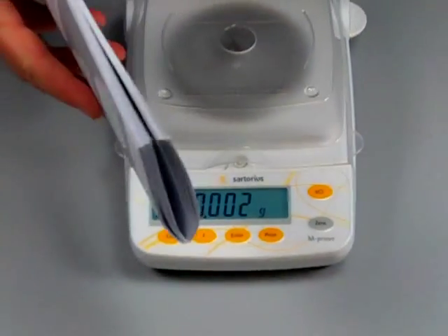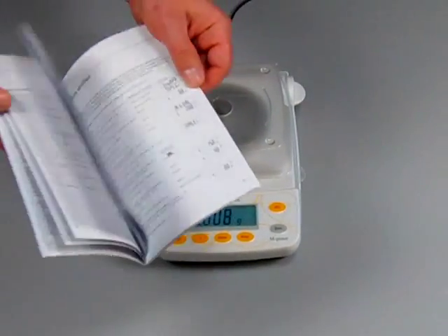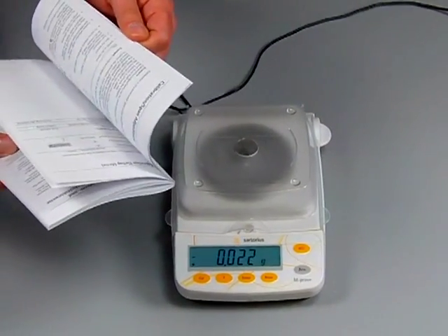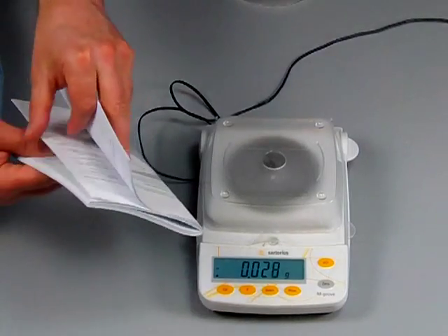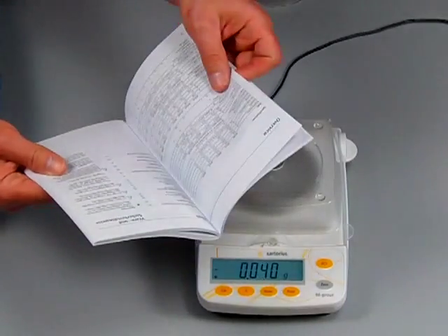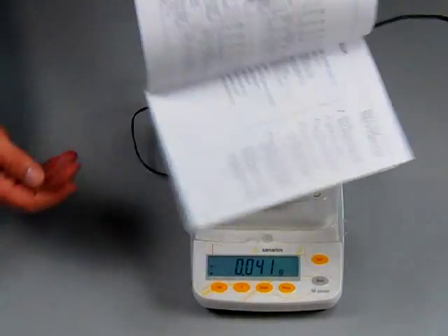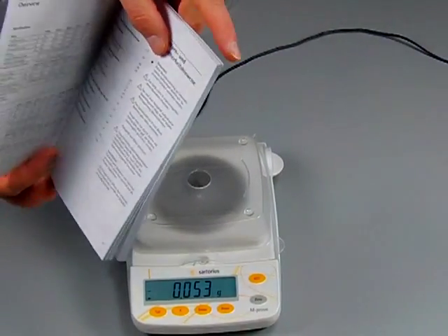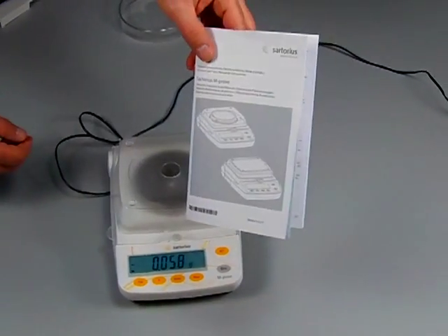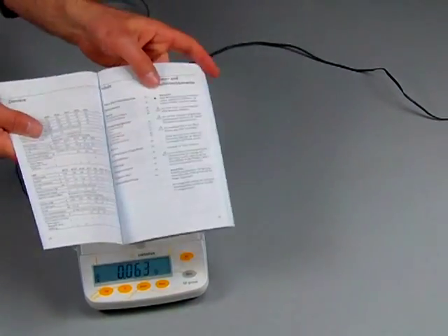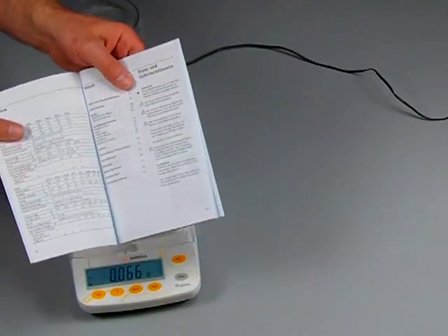Sartorius does give you a manual. It's a nice big thick manual. The amazing thing is, the manual for the US is only, let's see, part of this whole manual. We have basically 22 pages. So this is our manual, and this is for all the other countries. We have no idea. I mean, Sartorius is a German based company, really believes in the environment, yet we have all this paper here. But again, we have no control over it.